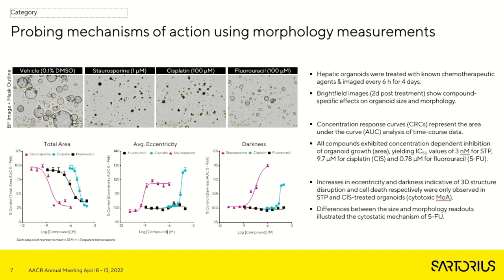As patient-derived organoids preserve the morphological and molecular characteristics of the tissue or tumour of origin, they are increasingly being used in vitro for drug development models. The ability to perform multiparametric quantitative measurements and distinguish between cytotoxic and cytostatic cellular responses is important to establishing effective anti-cancer therapies.